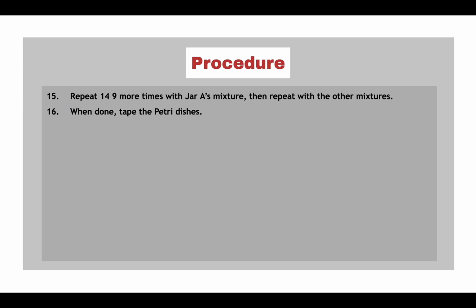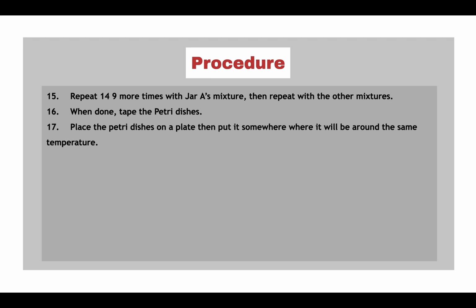16. When done, tape the Petri dishes. 17. Place the Petri dishes on a plate, then put it somewhere where it will be around the same temperature for a few days.